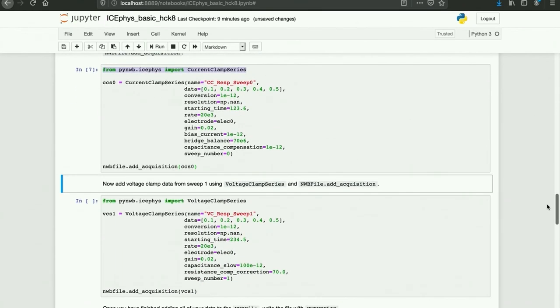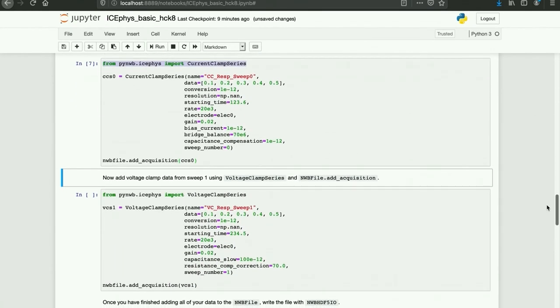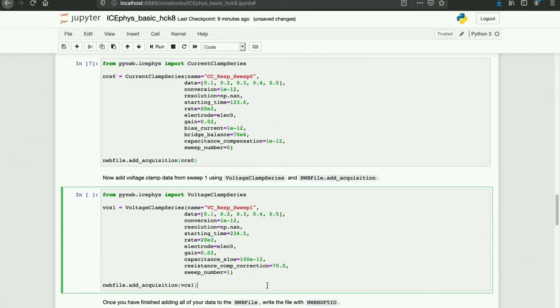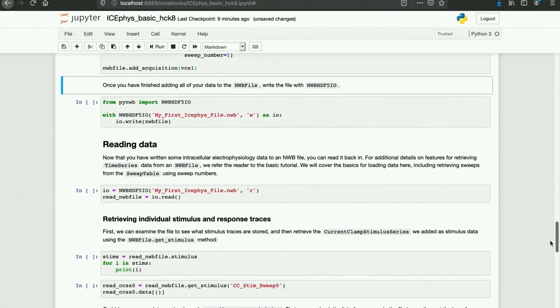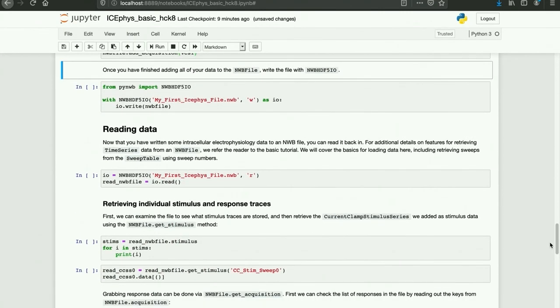Now I'm going to add voltage clamp data for sweep one using voltage clamp series and NWBFile.addAcquisition. Now that we have stimulus and response traces added, we can write the NWBFile using NWBHDF5IO.